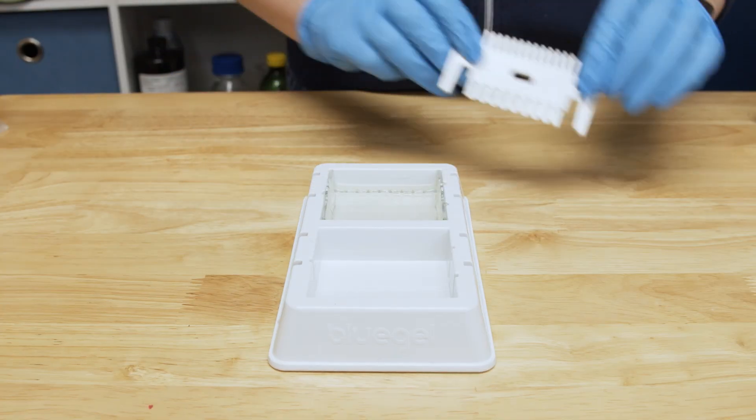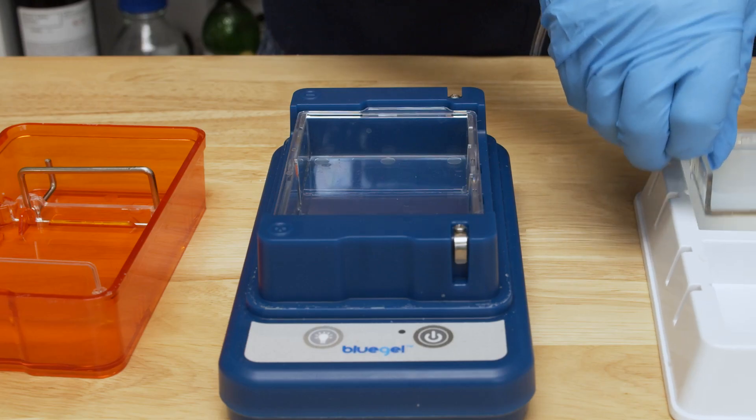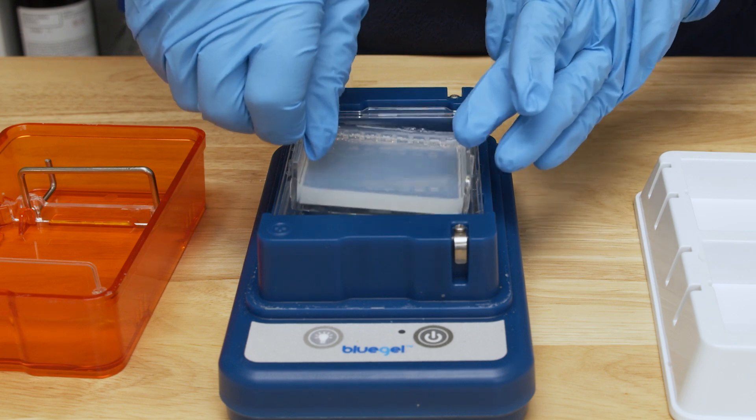Now you're ready to remove the combs and load your gel into your electrophoresis box. If you want to store your gels to run at a later time, you can prepare gels up to 5 days in advance. Wrap your prepared gels in plastic wrap or place them in an airtight container and store at room temperature, protected from light, for up to 5 days. Gels should not be stored submerged in buffer.